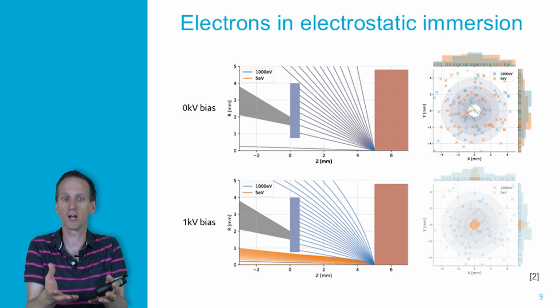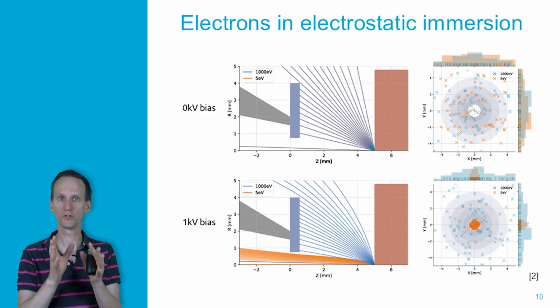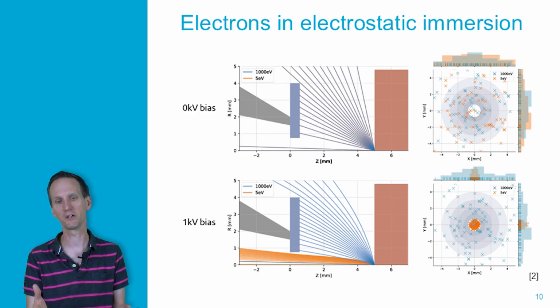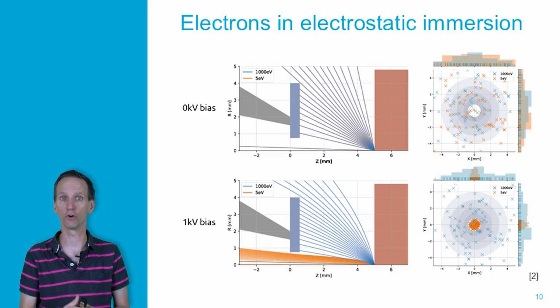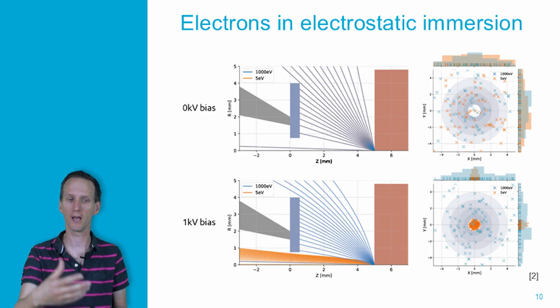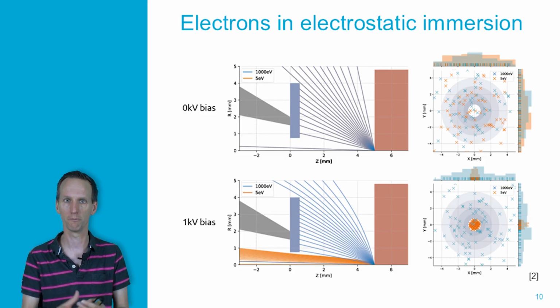Most of the secondary electrons actually go very close to the column and completely miss the detector. You also see that in the cross-section view, all secondary electrons passing through the position plane of the backscatter detector go through the hole in the center. Now interestingly, for the backscatters, we see also their trajectory curve, but it curves less because the impact of the field is less compared to the sidewards energy that these electrons may have, but they are still bended towards the detector. So there's some lensing which increases the collection efficiency of the backscatter electrons.